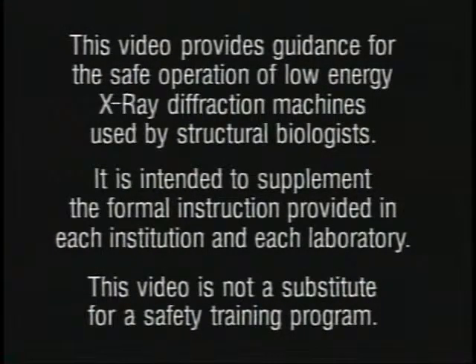This video provides guidance for the safe operation of low-energy X-ray diffraction machines used by structural biologists. It is intended to supplement the formal instruction provided in each institution and each laboratory. This video is not a substitute for a safety training program.